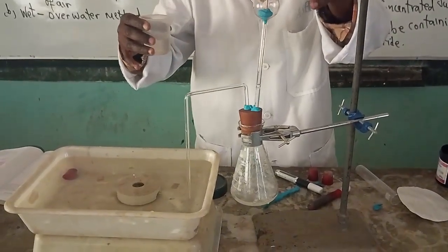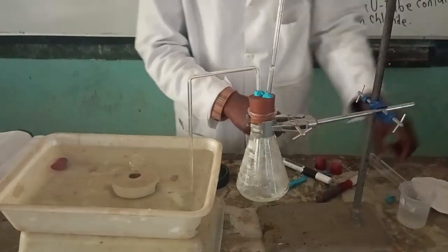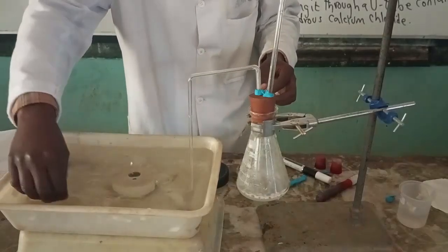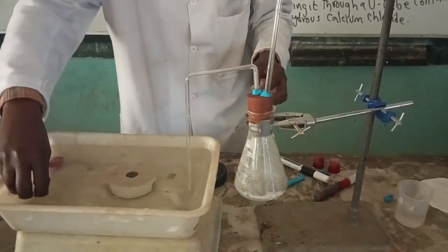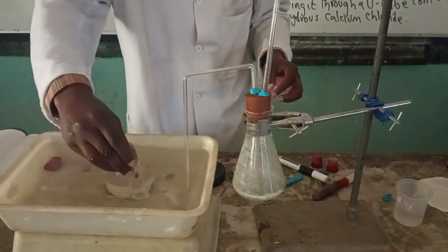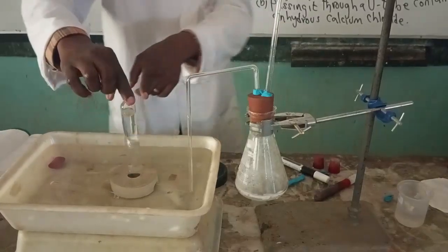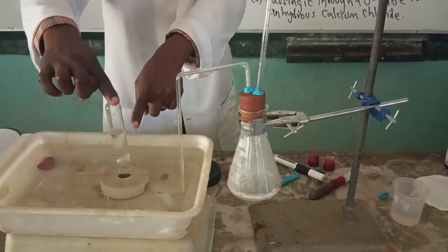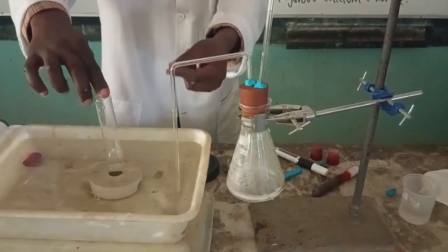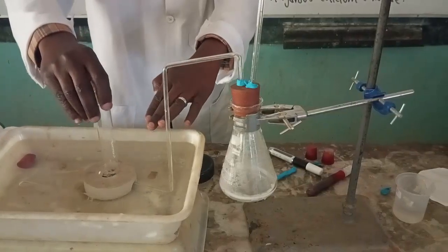So we cork that point, and we are going to collect with a boiling tube. We fill it with water, and the moment it is full, we can then collect our hydrogen. We collect our hydrogen, and there we go. You can see the hydrogen displacing the water. This method of collection, we call it downward displacement of water.